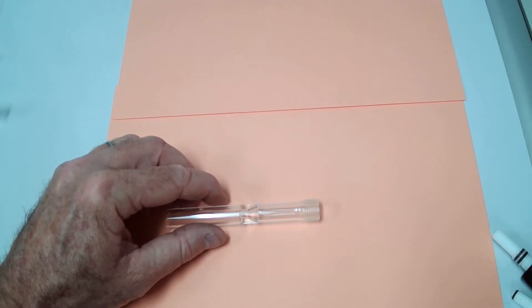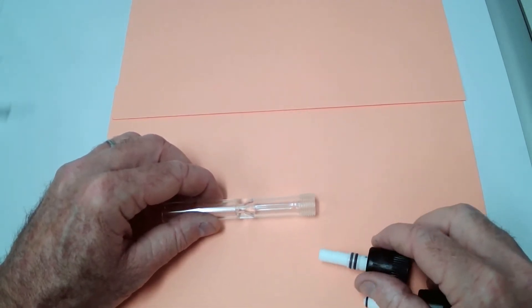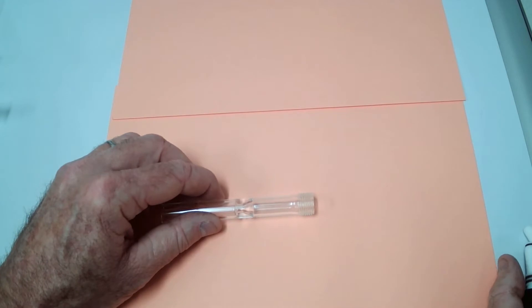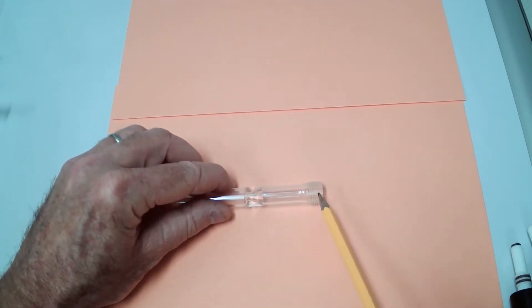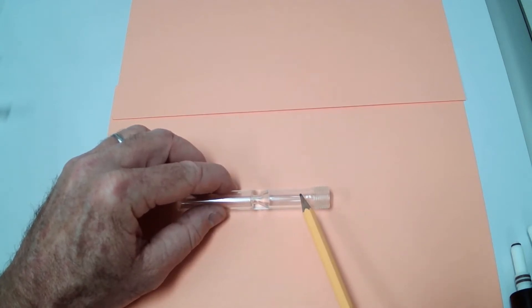This is a tutorial on high vacuum valves. They consist of the glass portion which has a fine external thread, precision bore tubing, and a tooled valve seat.